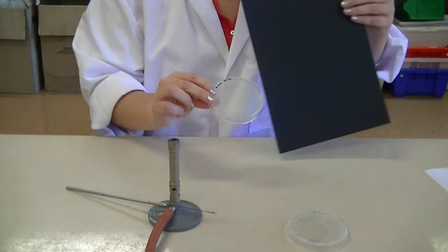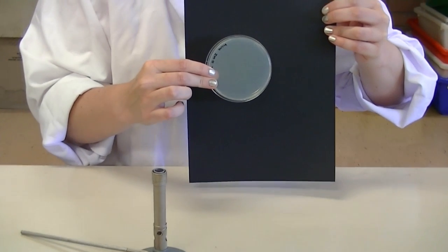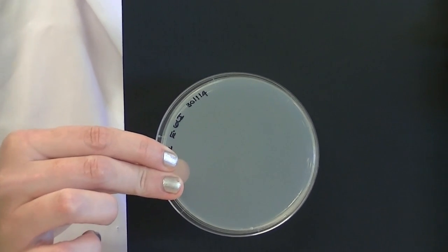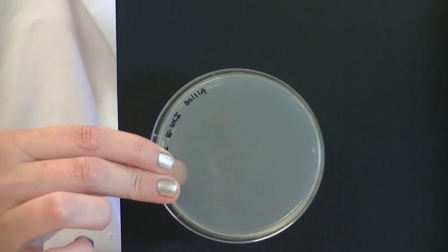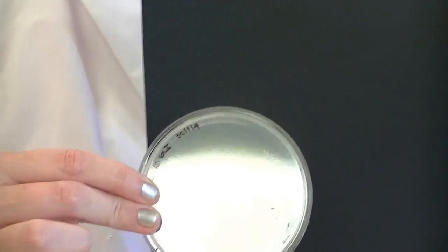Now that your plate is complete, you may be able to see the streak lines when you hold it up to the light. If you can see streak lines, that means that you have touched the loop to the surface of the plate and you should get some bacteria growing on there.